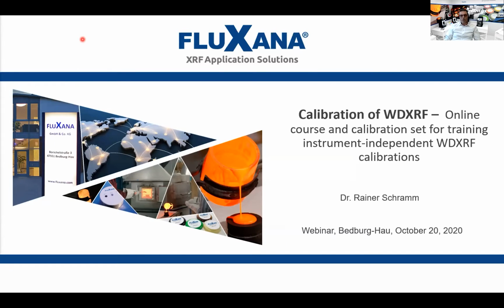I would like to guide you a little bit through the way how to do this kind of calibration, how to set up a calibration from scratch. And I also would like to present you a way, as a new kind of online course, you could use to do that at your own instrument in your laboratory and check it out in quiet, so that you have the way to do that 24 hours, 7 days a week.